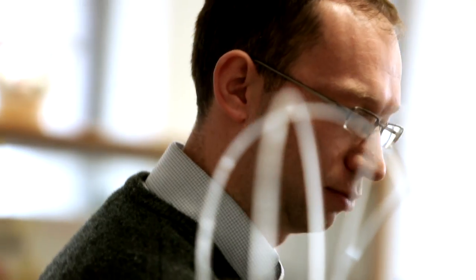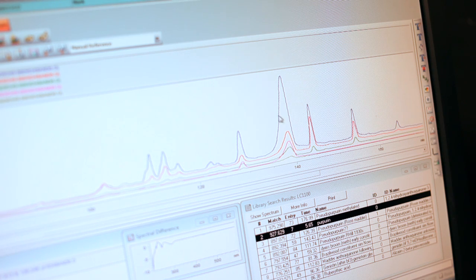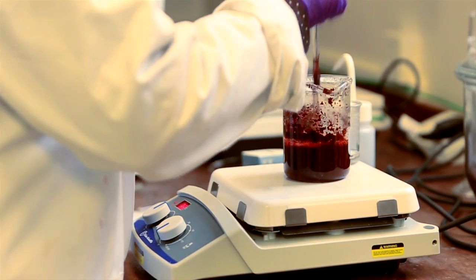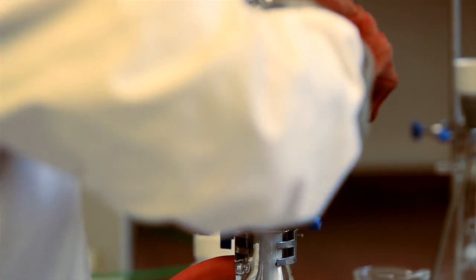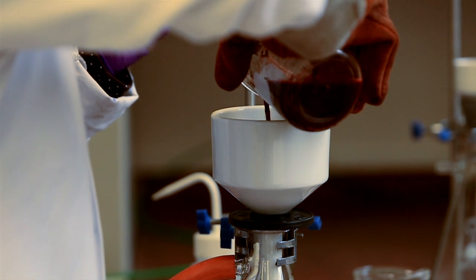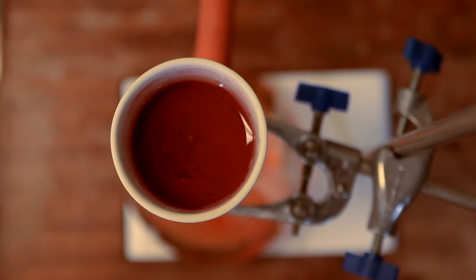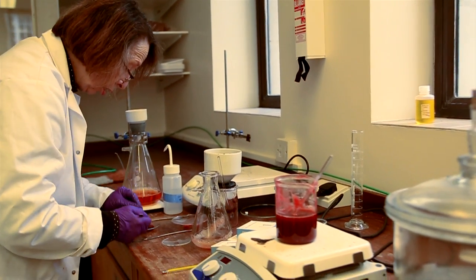Analysing a red lake using high-performance liquid chromatography can identify which of these materials were used. To understand the ways in which a colour could have been obtained, members of the department use historical recipes to prepare pigments. This is a 19th century method for obtaining red lake from madder root.